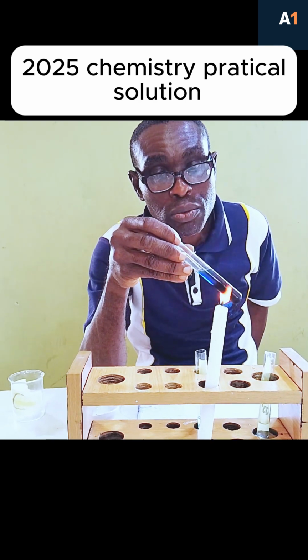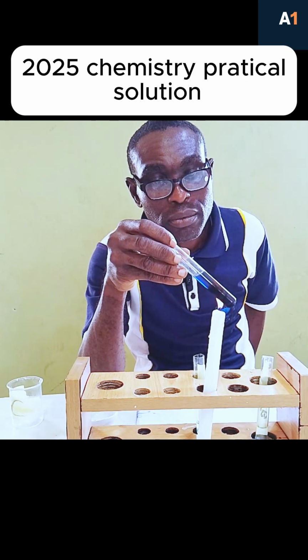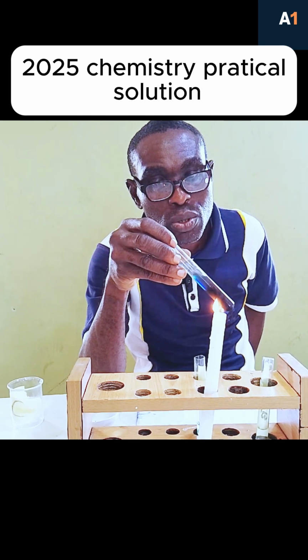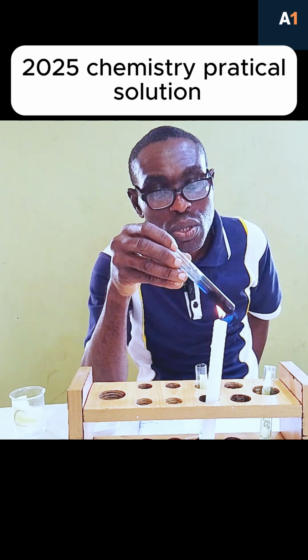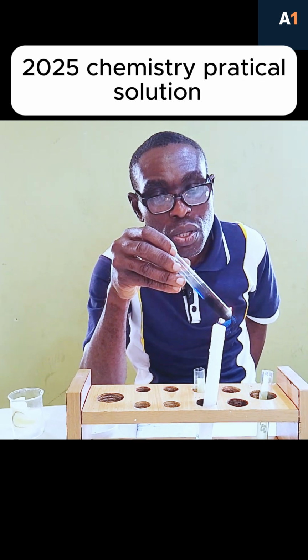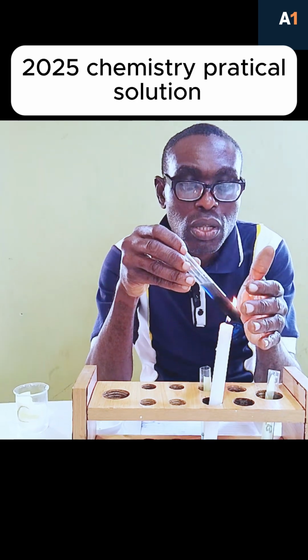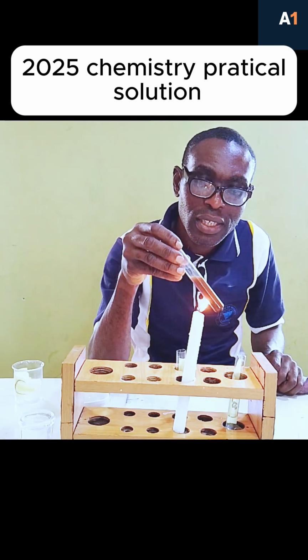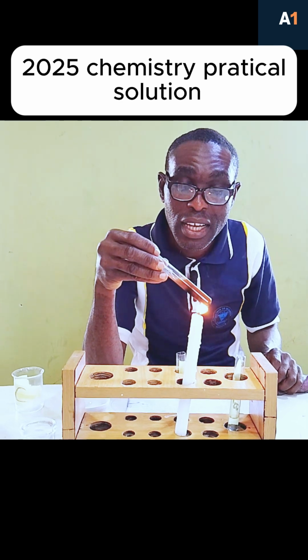Let's see what will happen as we are heating. You can see that it has changed to brick red, as I said.